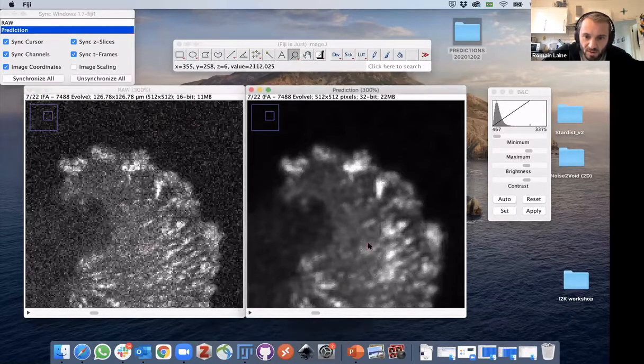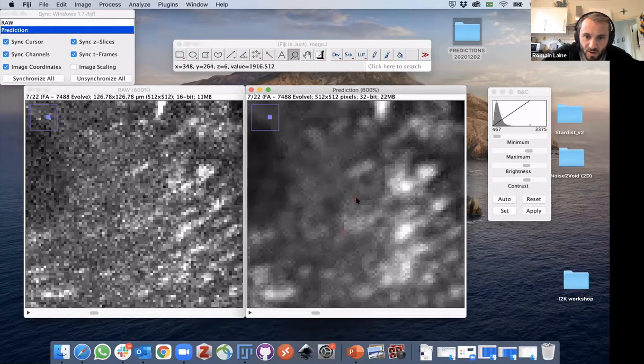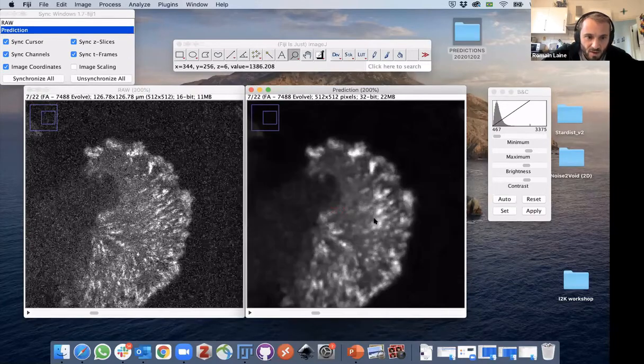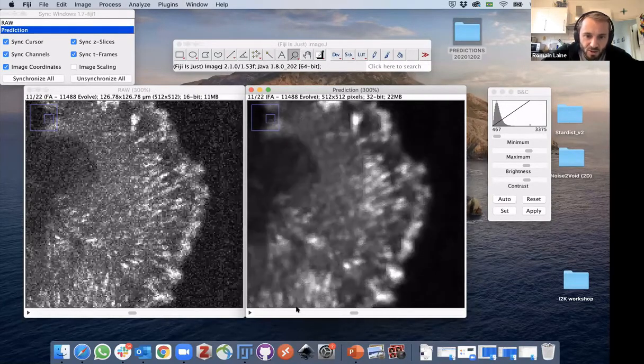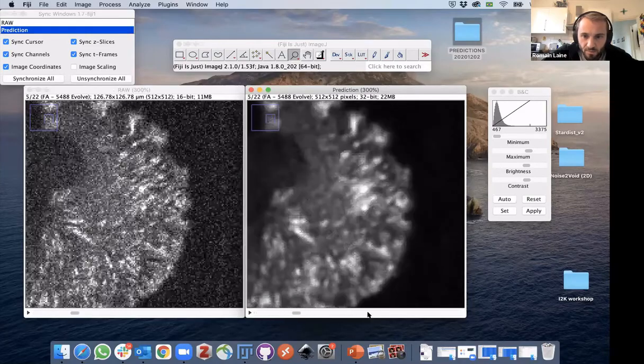But you might also see that there is a little bit of structure that has appeared in here. Okay. So that would tell me that maybe adding a bit more training data sets and maybe training for a little longer might improve also those kind of mini patterns. Okay, so you can also start picking up things by purely a visual inspection is already quite useful.